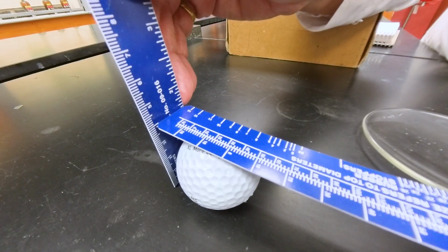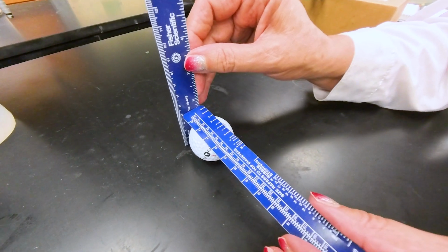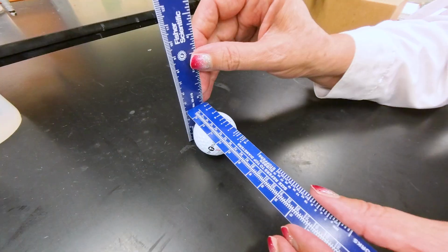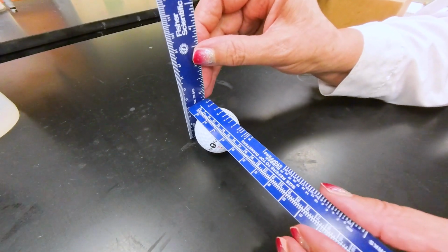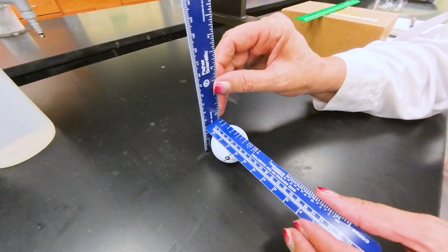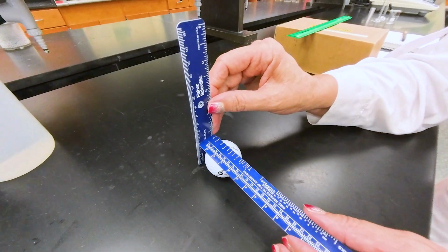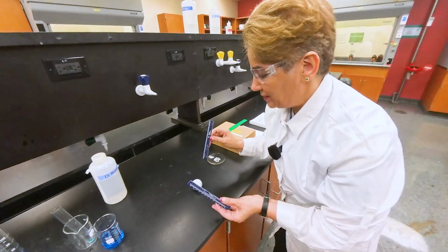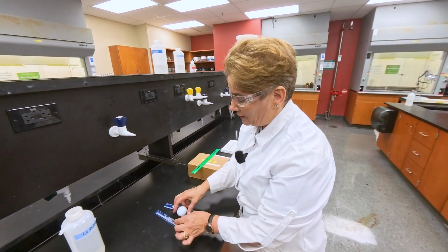This number is between 3.9 and 4 centimeters. The unit on the left side is centimeter, on the right side is inch, and we are using the left side. So it's between 3.9 and 4, and you again use the still shot to estimate the last digit, so 2 decimal places, and do the calculation using the formula given in the lab manual.